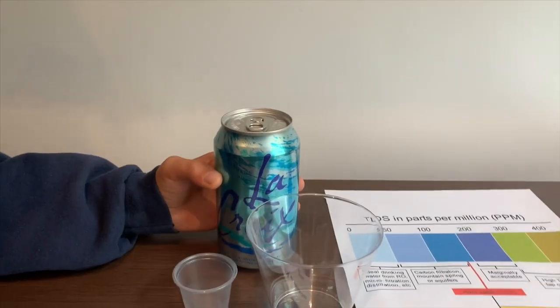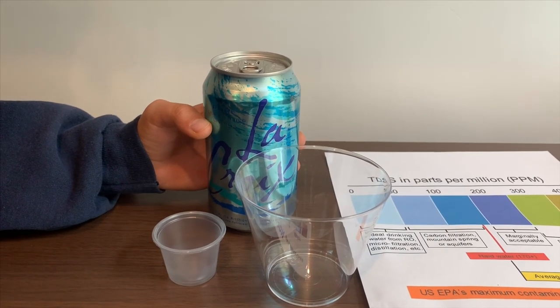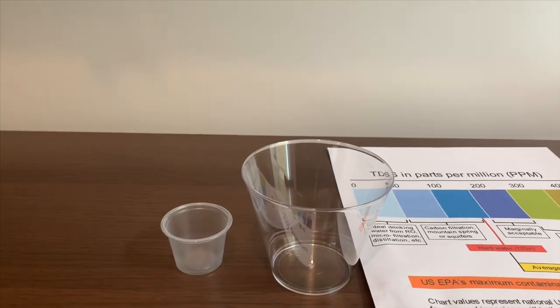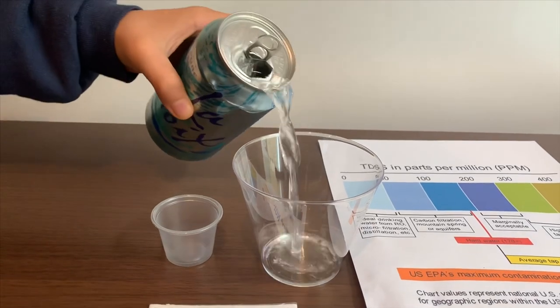This is LaCroix Sparkling Water. We got it with a pack of sticks and it cost $4.19. Let's test the pH and TDS levels. It is from the U.S.A.